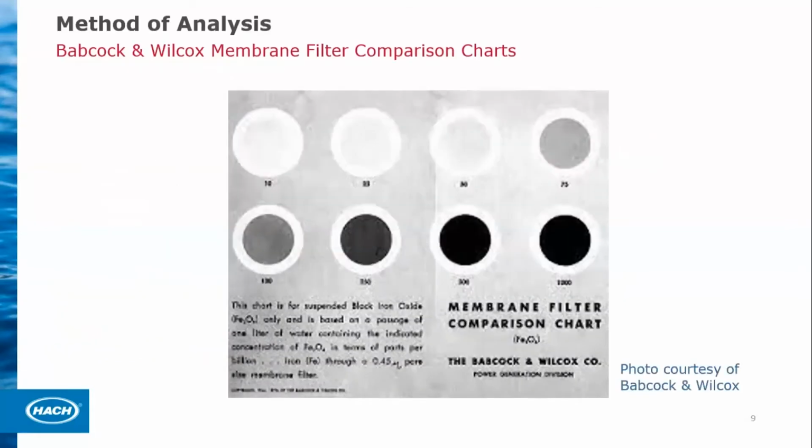So you've probably all seen this filter chart. And again, some utilities really rely on this. Again, it's a method that's been around for a long time. And what I'm going to say is that any method done properly is better than not doing a measurement at all. However, doing a measurement and not doing it properly is probably just as good as not doing it.